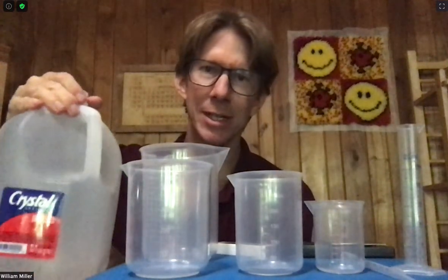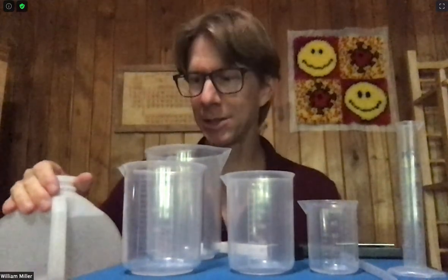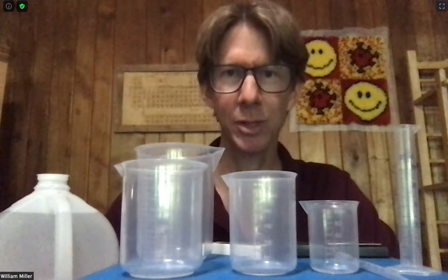You will also need distilled water. I have a gallon of distilled water right here that should be enough for the entire semester — plenty, by the way. If you don't have access to distilled water or didn't purchase it, tap water is an okay substitute. Just make sure that you note it on your lab when you submit it.